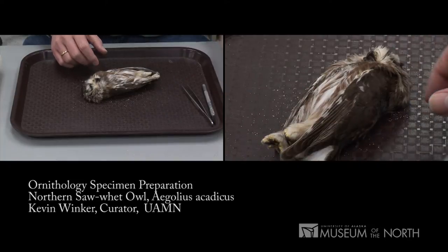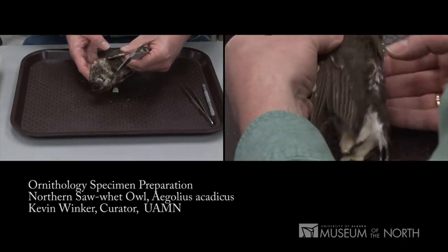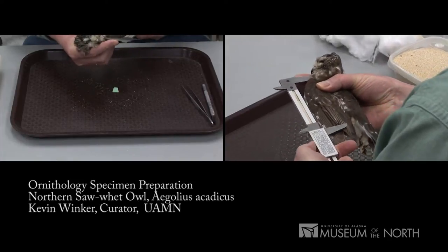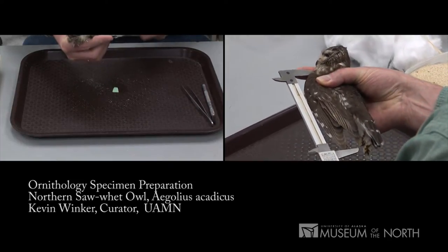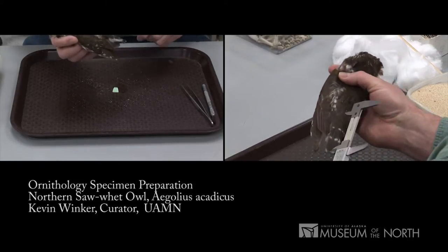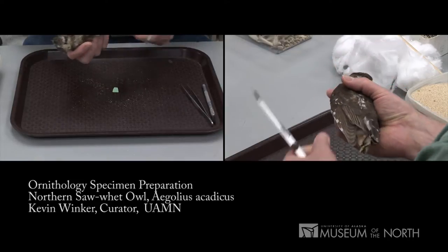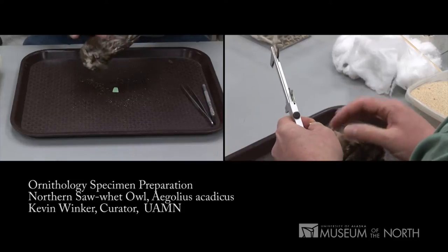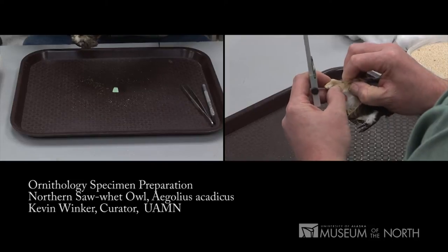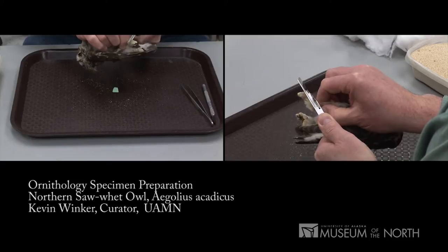I've weighed it, pre-labeled some tubes for the tissues, and measured it. The way we measure a bird is we measure the chord of the wing — the unflattened wing — from the wrist to the tip. There's also a tail measurement done from the middle of the two rectrices to the tip, and a tarsus measurement — the tarsometatarsus, or the bird's ankle — from the back of the ankle bone to the beginning of the toe bones.